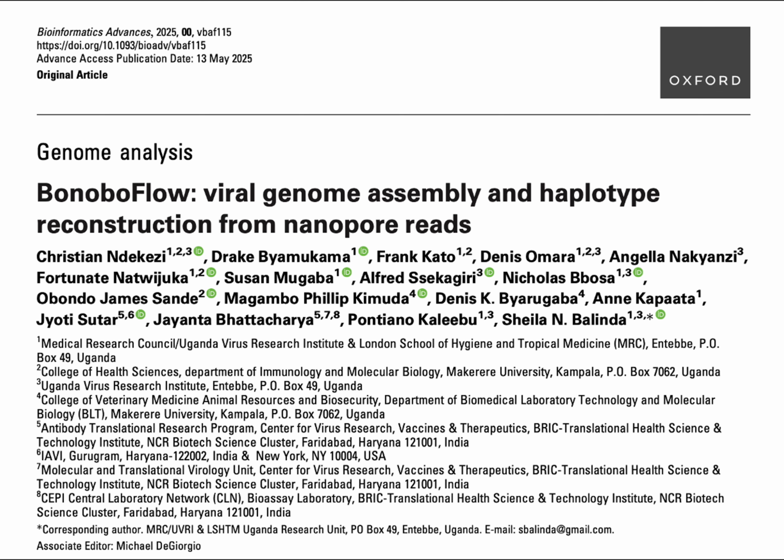And the data quality was good. It was. Average read length around 4,700 base pairs, average Phred quality score of 30, so high base calling accuracy going in. They then benchmarked BonoboFlow against Accuvir and Genome Detective using this real HIV data. Okay, moment of truth. What were the critical findings? Well, first off, the phylogenetic analysis, looking at the evolutionary relationship, showed high agreement. All the pipelines generated consensus sequences that clustered closely together. That's reassuring. Good consistency. Yes.